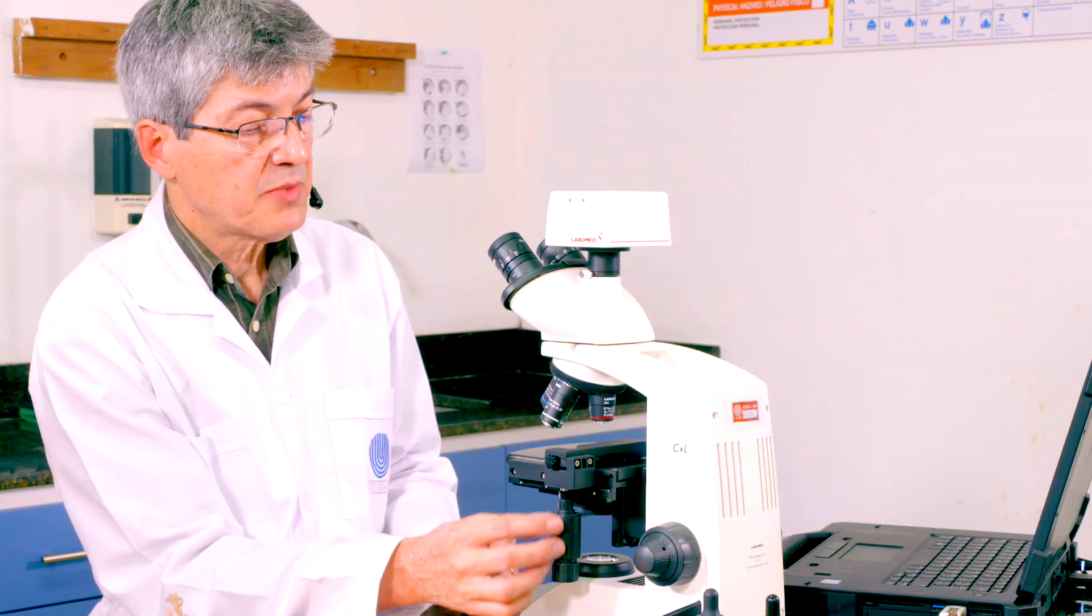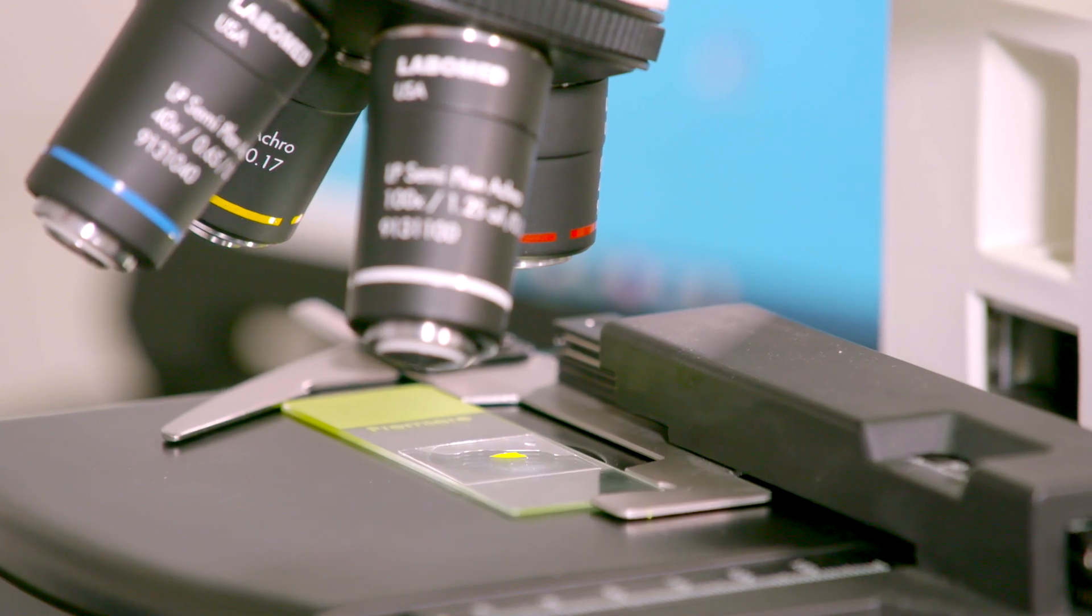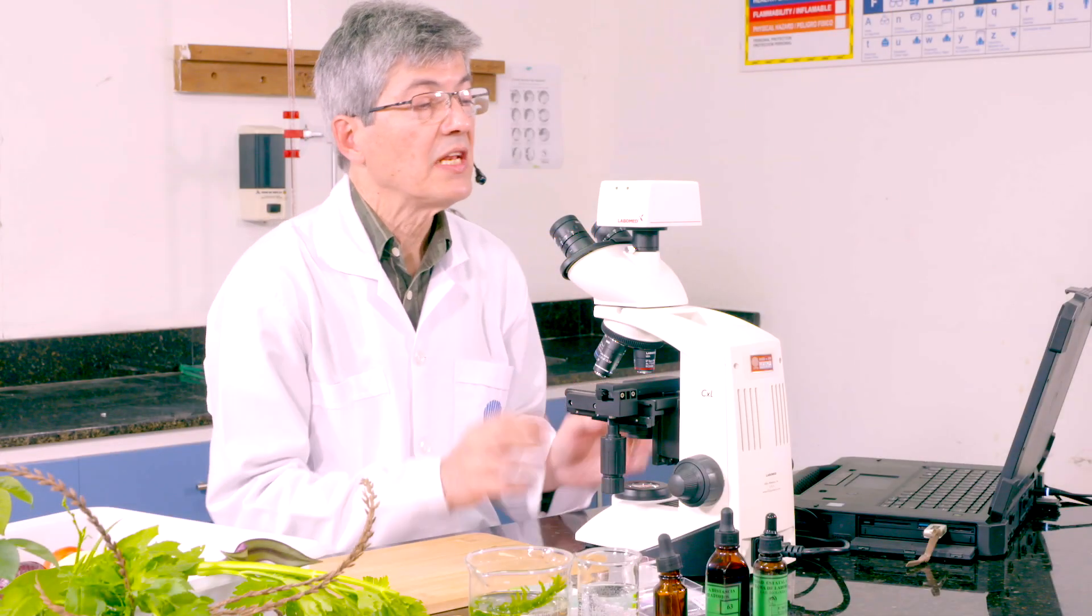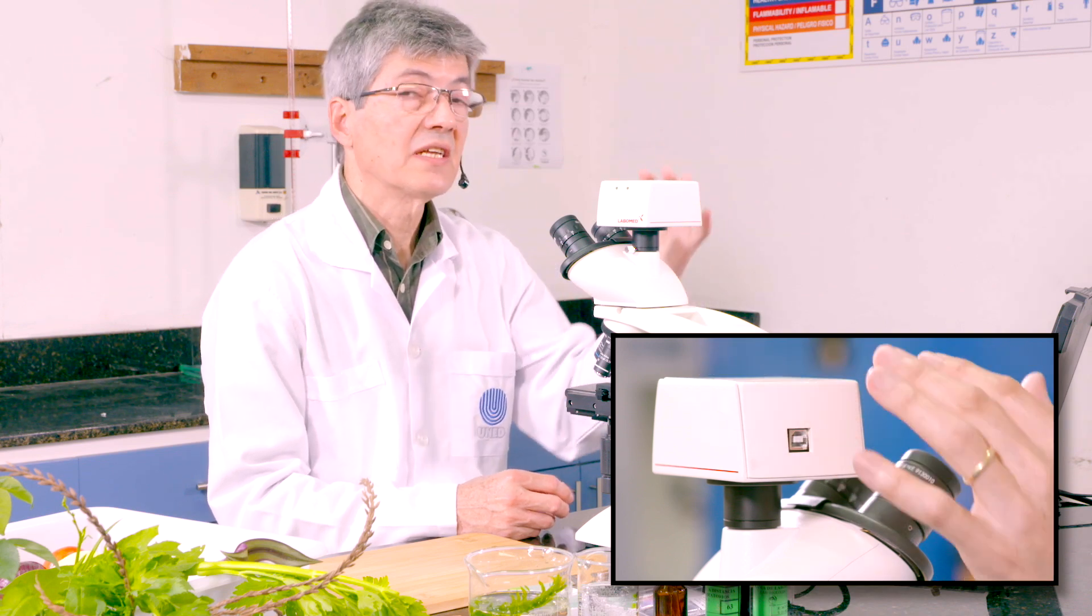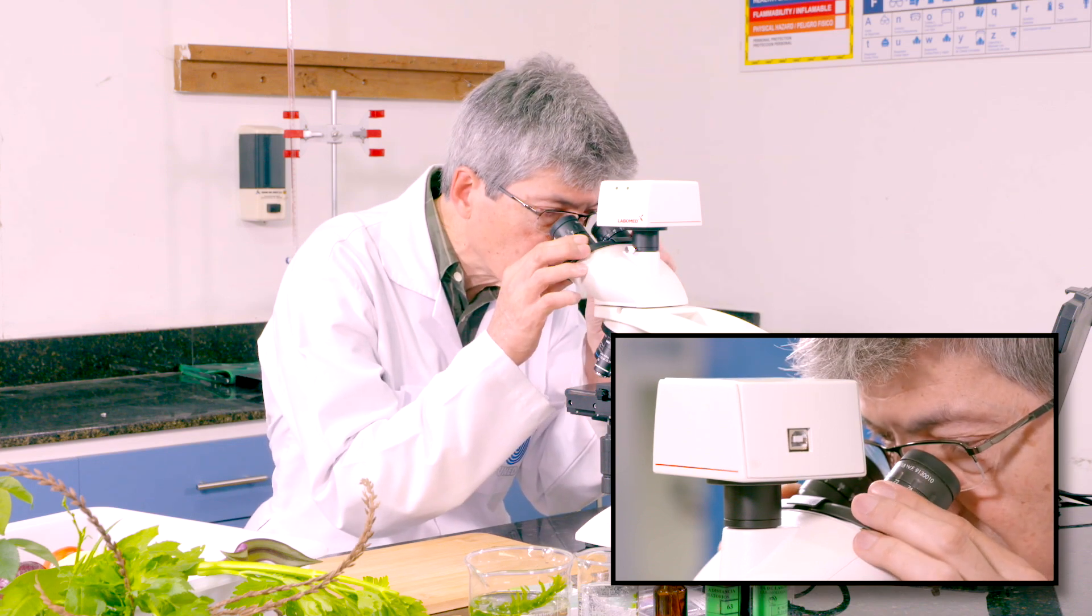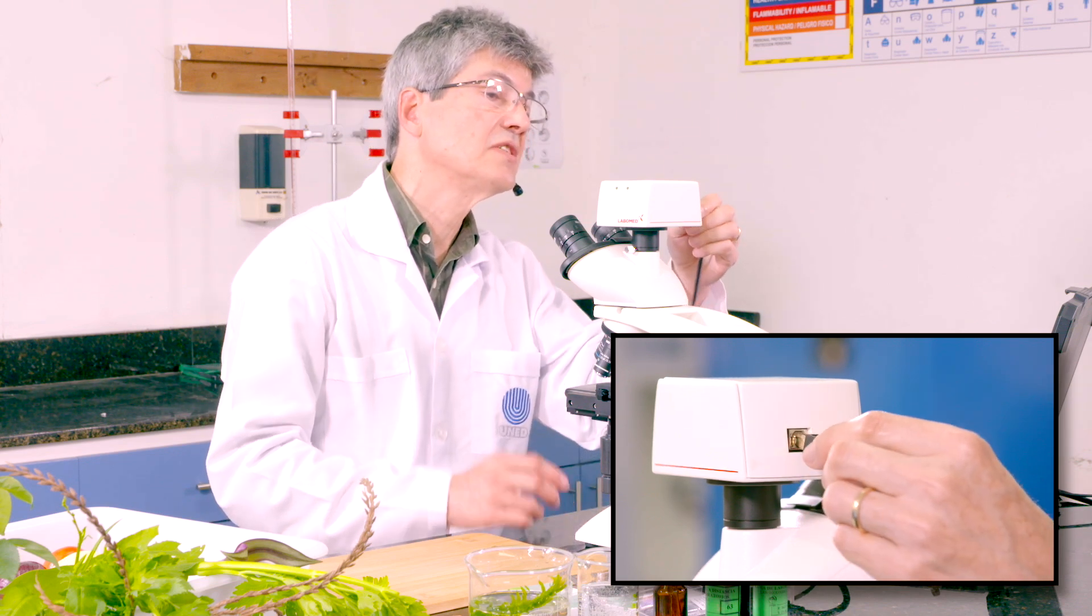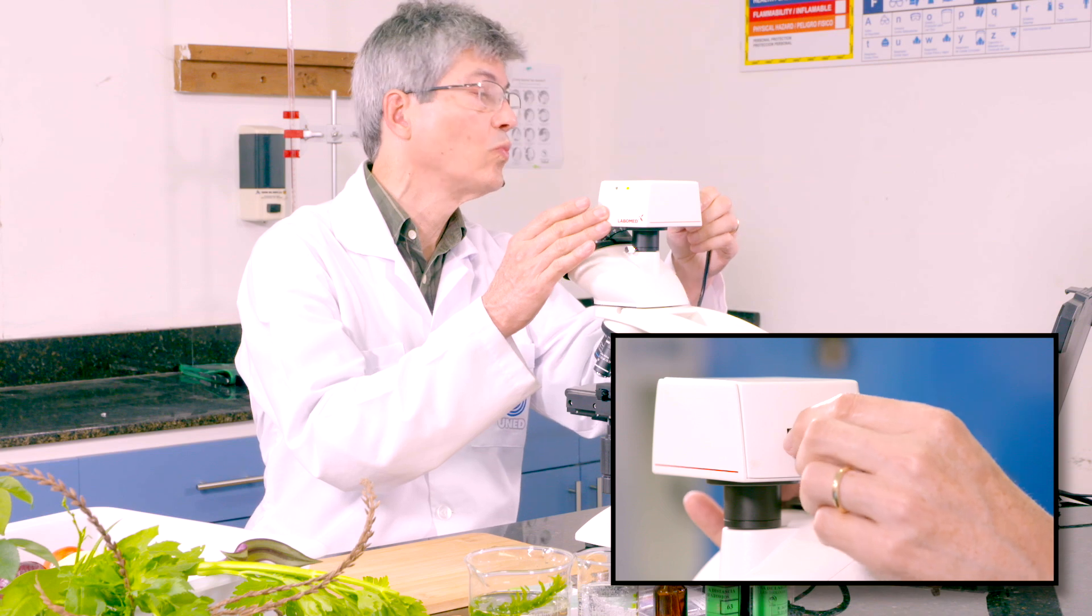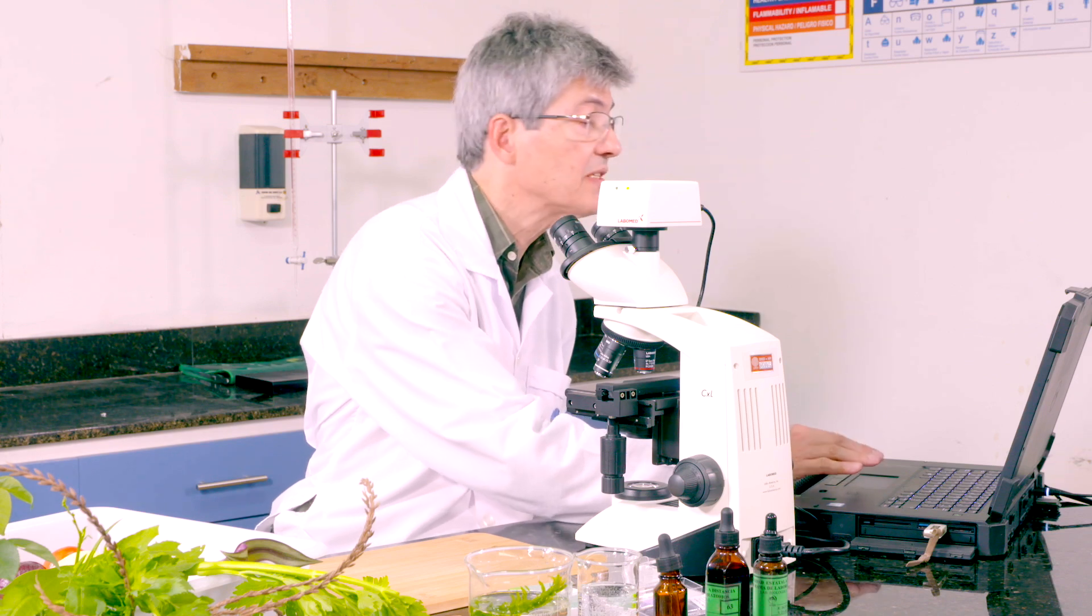Procedemos a encender nuestro microscopio. Y utilizando las perillas que mueven el carro, vamos a utilizar nuestra muestra exactamente por donde va el haz de luz. Con este microscopio tenemos la gran ventaja de que tiene una cámara adaptada. Con esta cámara ustedes van a poder apreciar lo que yo estoy viendo a través de los lentes oculares. Entonces vamos a proceder a conectar la cámara a nuestro sistema de cómputo. Y vamos a proceder a abrir nuestro programa para que ustedes puedan apreciar lo que yo estoy viendo también.